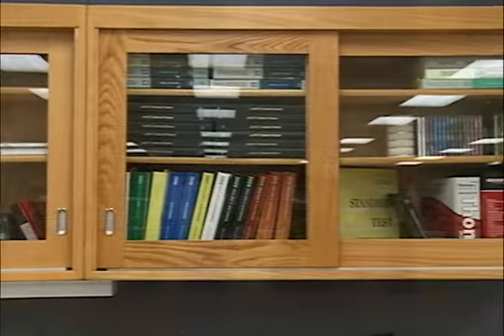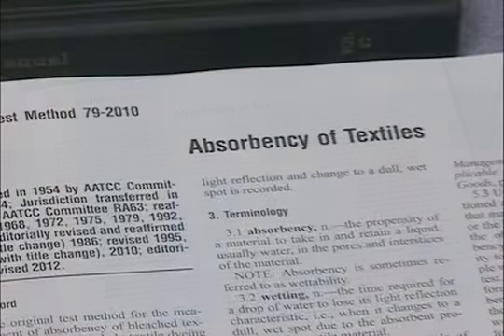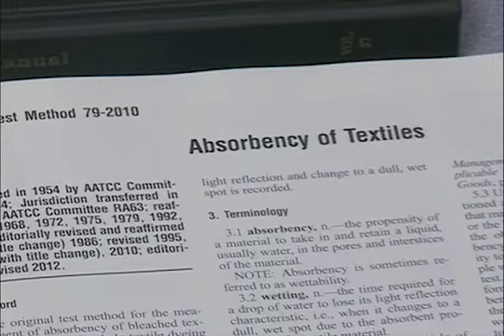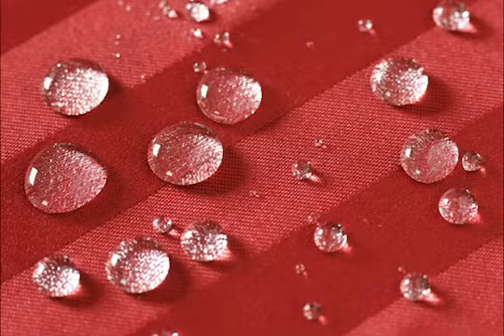Test Method 79, absorbency of textiles, has been widely used since 1954 as a key quantifier of successful textile fabric preparation, dyeing, and finishing. It's often referred to as the water drop test.